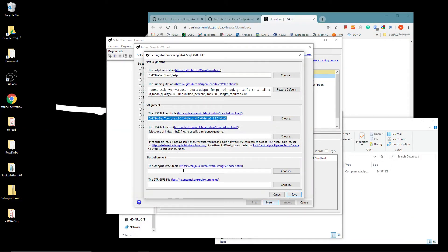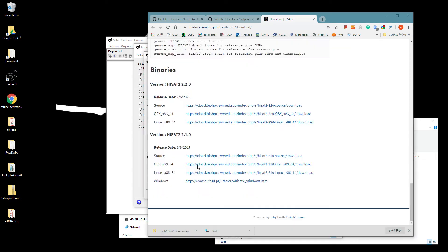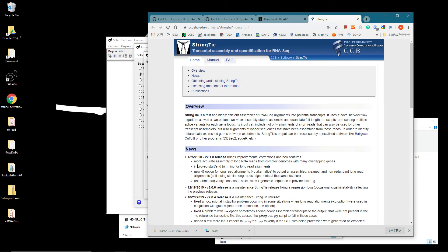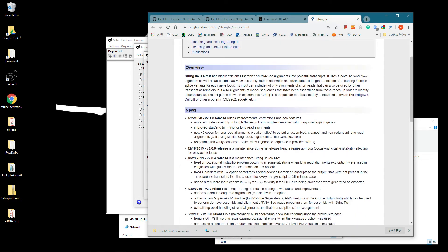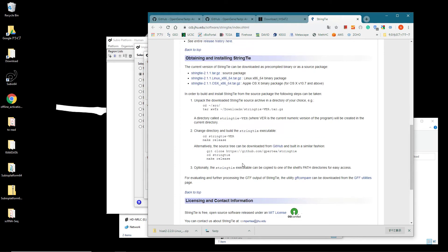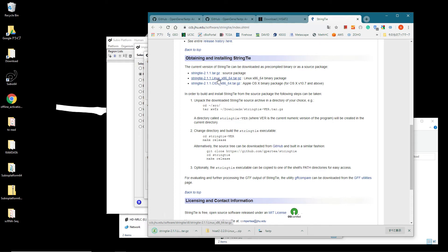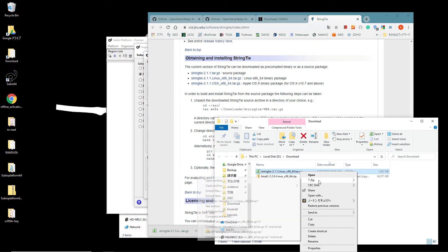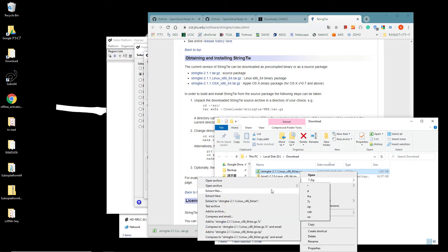Click the link at the StringTie executable, the last one. Download the binary file for Linux systems. Unarchive the .gz and .tar sequentially to extract the folder.